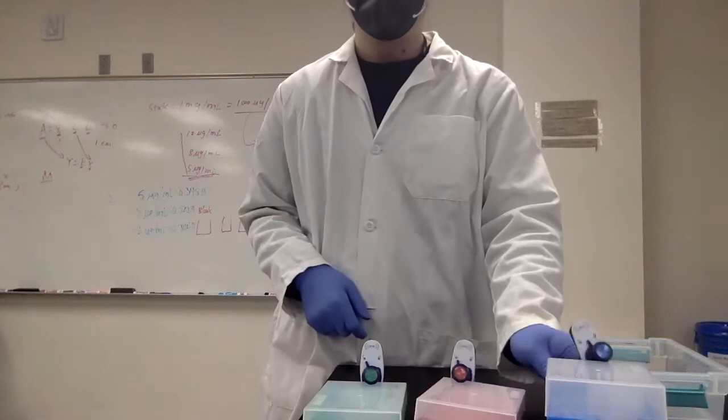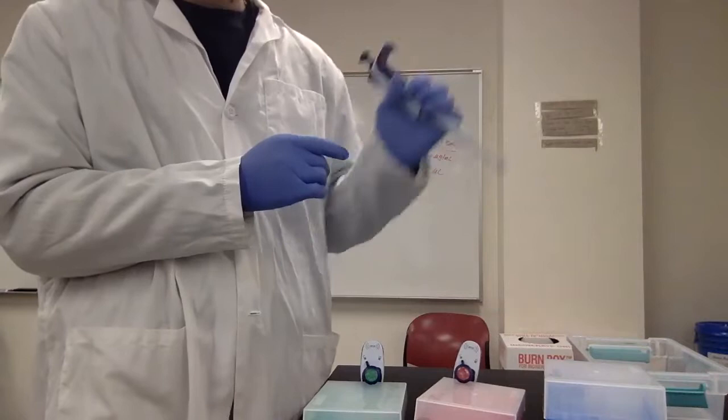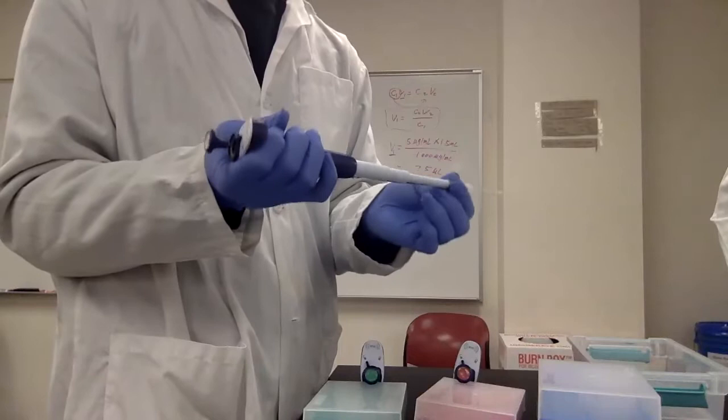So one notice here, never ever put this pipette into liquid without attaching a pipette tip. Just attach one pipette tip on the pipette. Make sure the attachment is close enough, it's airtight.